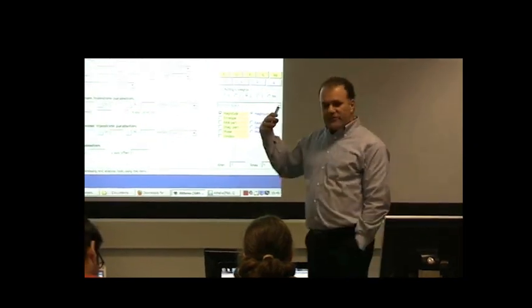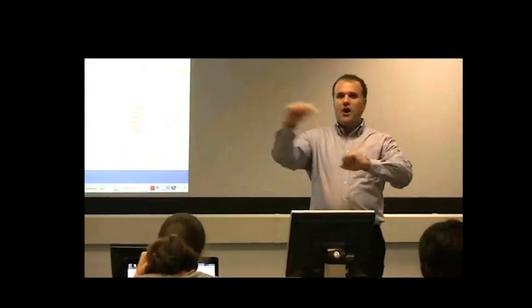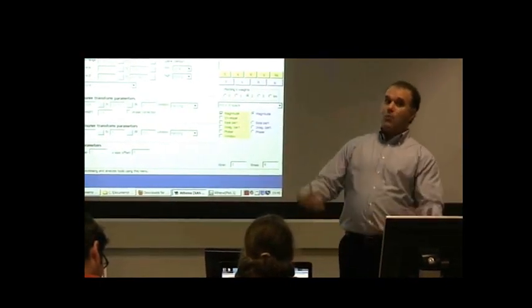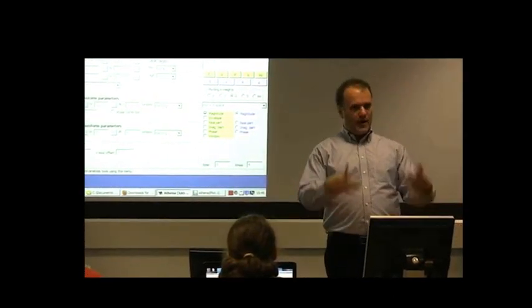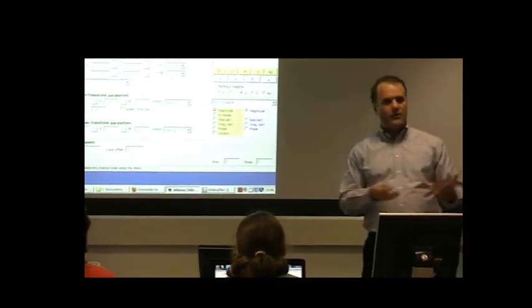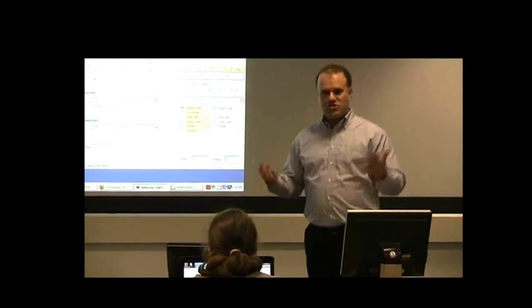That sounds a little bit scary. It sounds like I just told you that there are like knobs and fudge factors that you can change to make the background happen the way you want it to happen. And that's not what I mean. And I think I explained that a second ago when I explained what the criterion for a background removal is, which is that it doesn't damage the data, that the background is not highly correlated with the parameters that you get from the fit. And that assertion still applies.